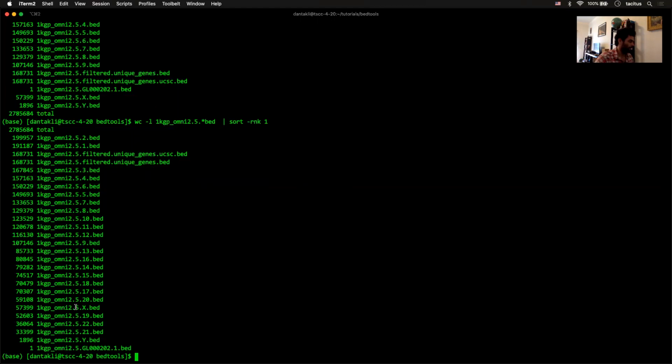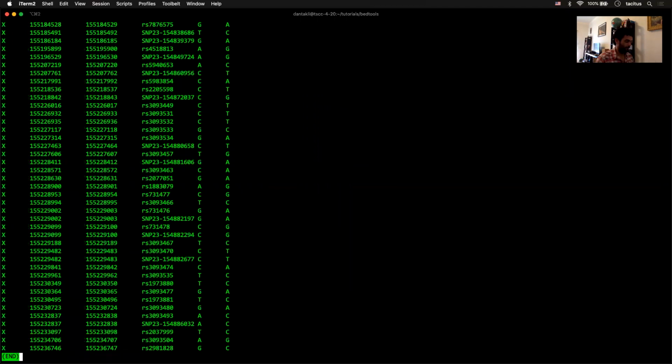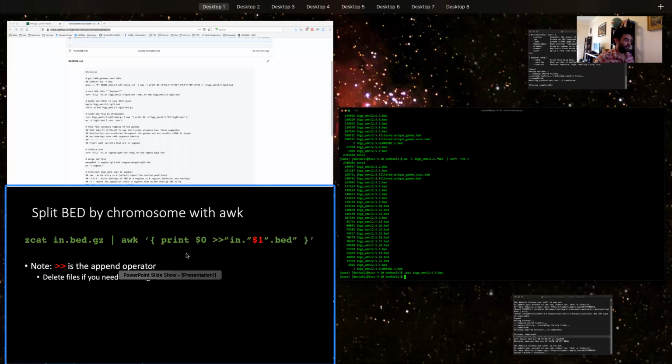And if you want to look at the chromosome X one, you'll see that these variants are all in chromosome X. So that's a nice little thing to learn.